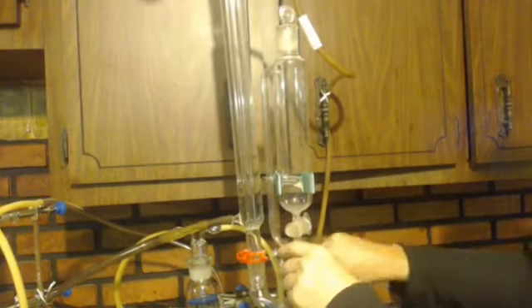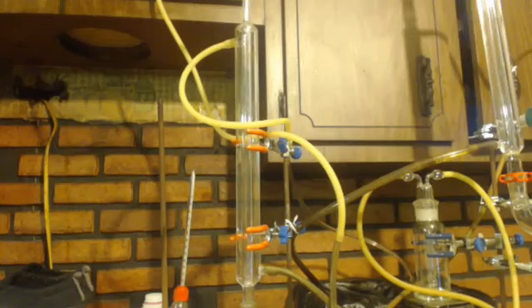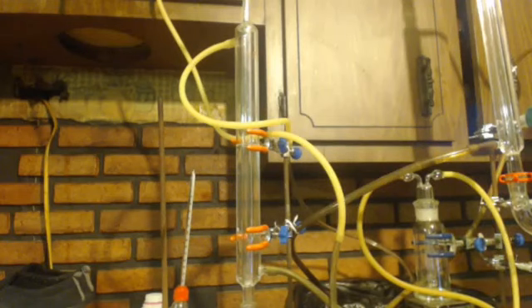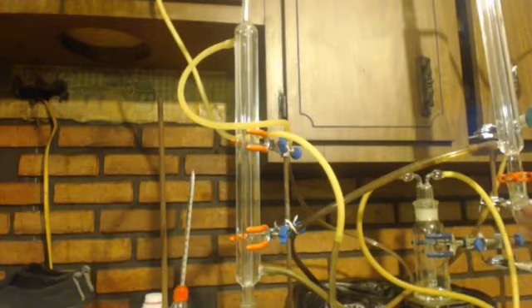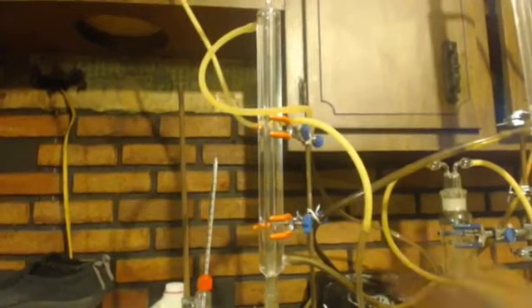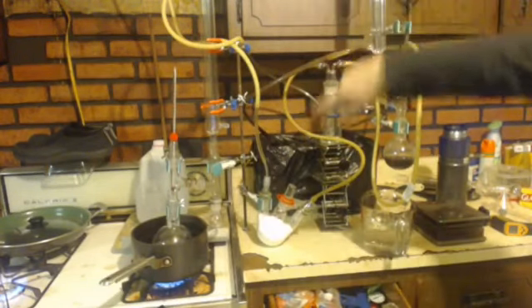Now I'm going to change out the funnel with the tube. Since I'm starting to make the carbon dioxide, I'm going to have to turn this one on too. I basically got both of these in series. See, it comes through here, and then it comes over here. That way I just used one pump. Now I'm going to turn on the oil, and I already told you about the carbon dioxide.